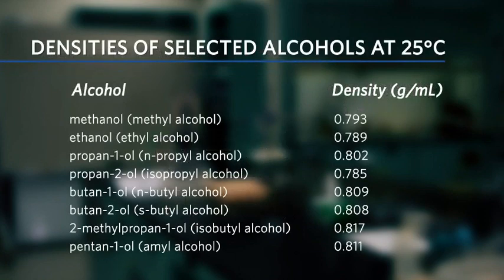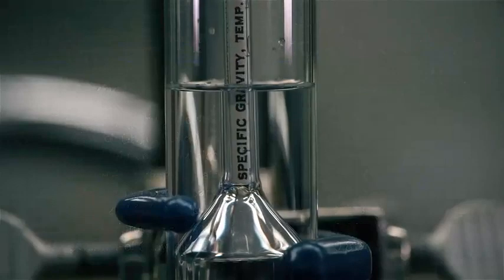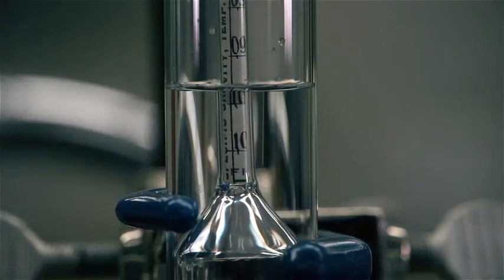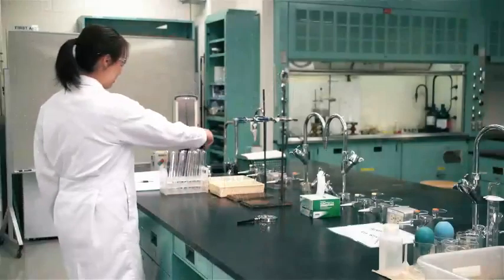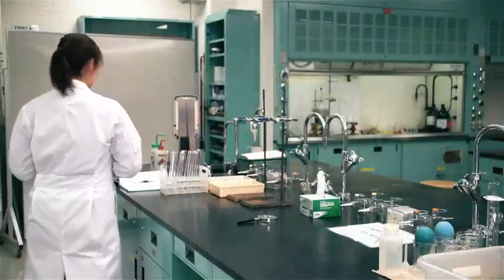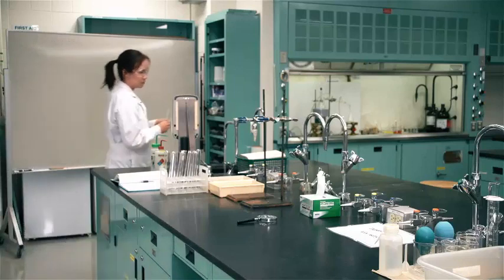Densities of pure substances are tabulated in reference tables. Densities of solutions have to be determined using the appropriate hydrometer. Flow times will be measured using an Ostwald viscometer. This video will present the operation of a hydrometer, then it will present the operation of a viscometer.